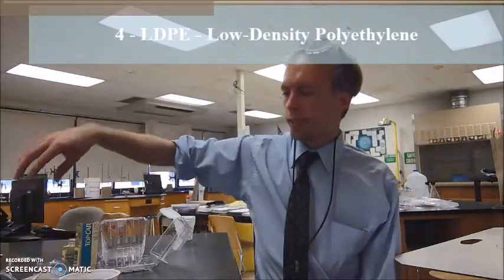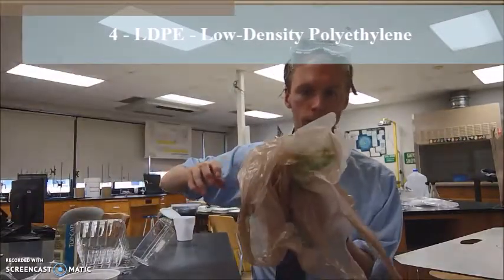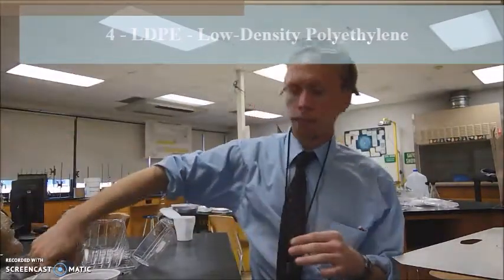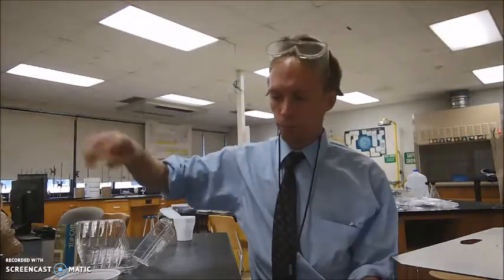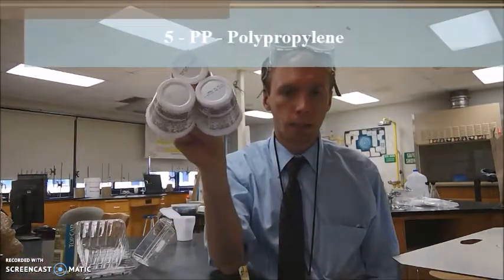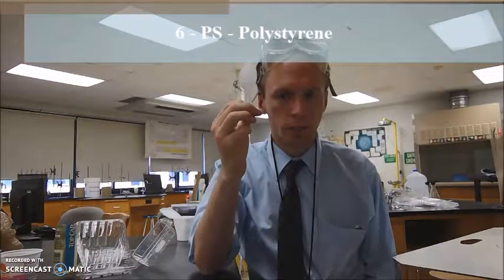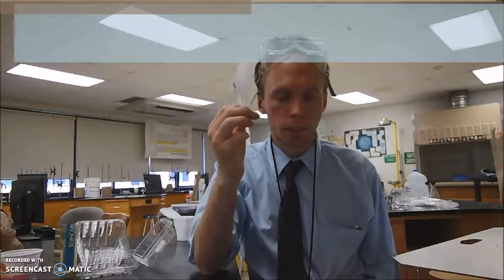Next, number four is low density polyethylene, LDPE. You're going to find these in disposable plastic bags and in six-pack containers. Number five is polypropylene. You'll find it in common consumer product plastics. Number six is polystyrene. One of its most common applications is in disposable plastic utensils.